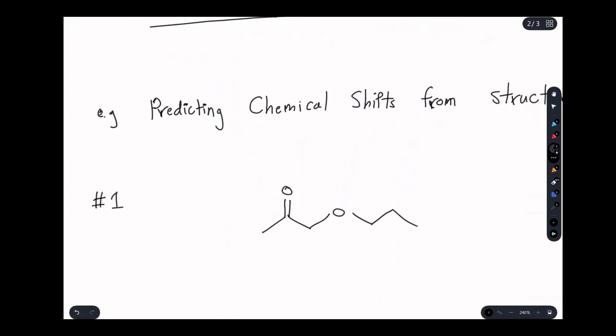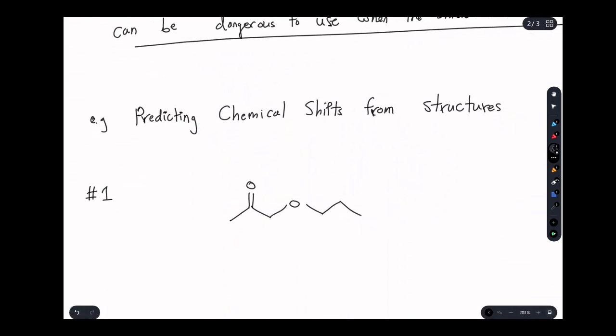What do I mean by that? Take a look at this molecule here. So, if I was to ask of the ppm of this signal, these 3 hydrogens located here, right, we might notice that we are one carbon away or adjacent to a carbonyl, which would put us somewhere in the ballpark of around 2.4. Great. What about these hydrogens here? Well, they are directly adjacent to an oxygen. That's 2 bonds away, they're closer, and we would expect them somewhere around 3.5.